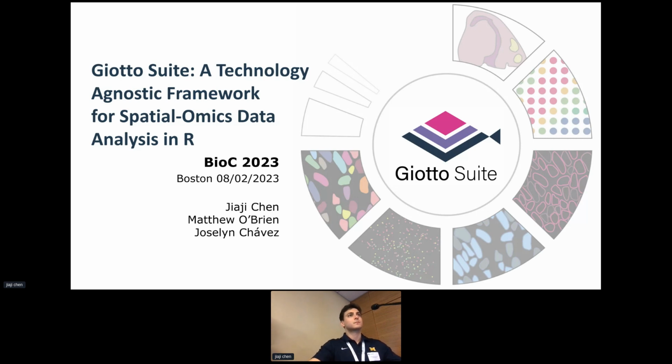But then at that point, your image has a different puncta, which is the location of your transcripts. So then could you use Giotto there to count puncta per DAPI signal? Or is it out of the scope of Giotto?